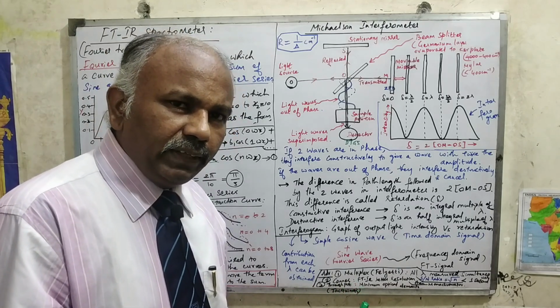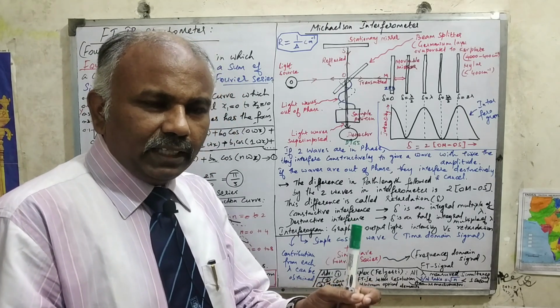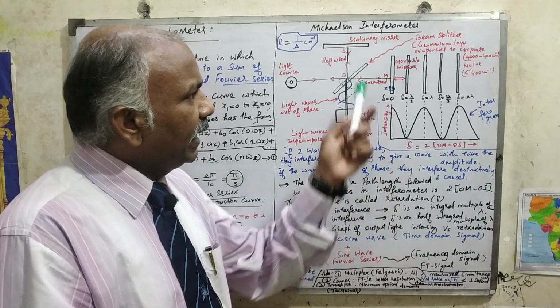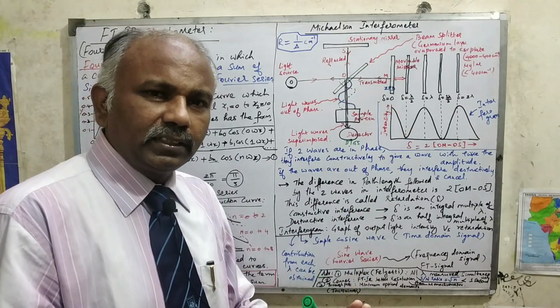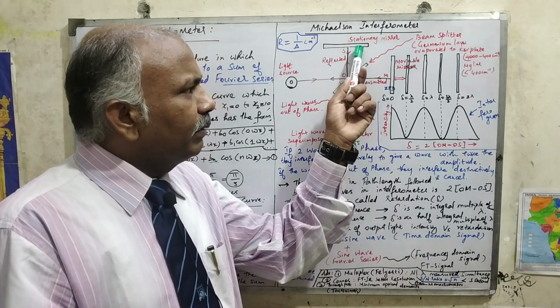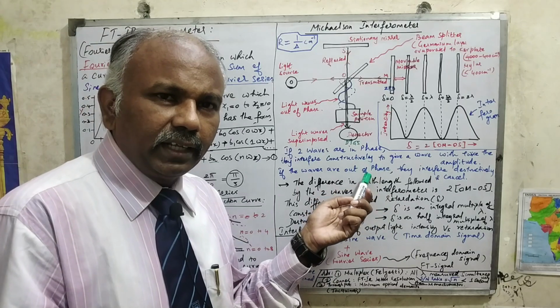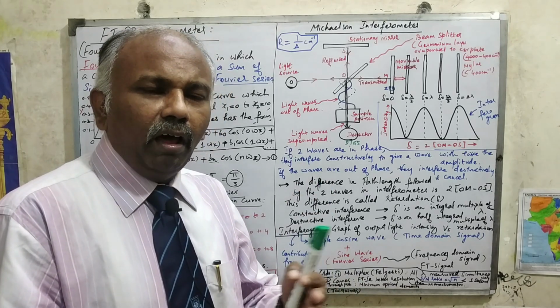And the last important advantage of the FTIR spectrometer is the throughput advantage or Jacquinot's advantage. What is called the throughput advantage? The term itself indicates throughput. Completely you will be getting all the radiation. In a dispersive IR spectrometer, we are using a lot of optical elements, right? But in an FTIR spectrometer, we are not using so many optical elements. We use only a stationary mirror, a mobile mirror, and one beam splitter. That's all. But in the previous dispersive case, a lot of mirrors, lot of optical elements, slits, lot of things we were using. So here there is minimum utilization of optical elements. Therefore, whatever radiation reaches the detector will be a maximum input of radiation. That is why throughput radiation will reach the detector, which is also called Jacquinot's advantage. So these are the three important advantages of the FTIR spectrometer over the normal dispersive spectrometer.